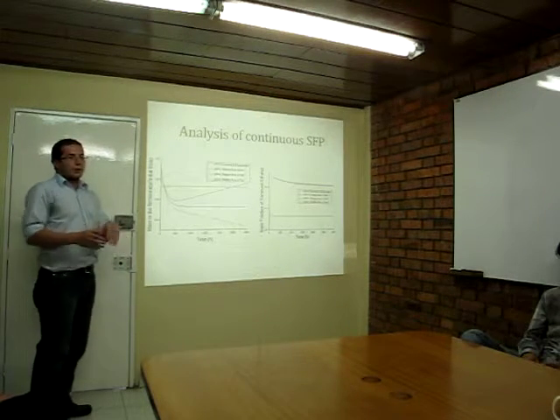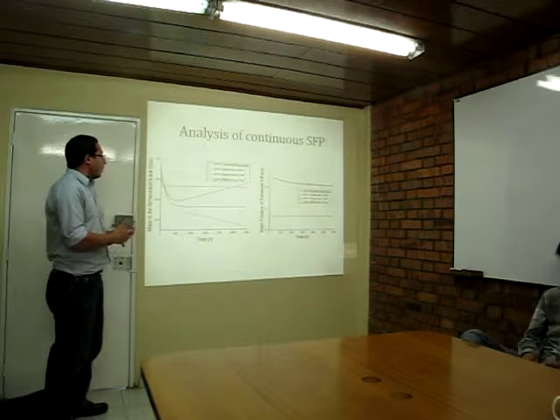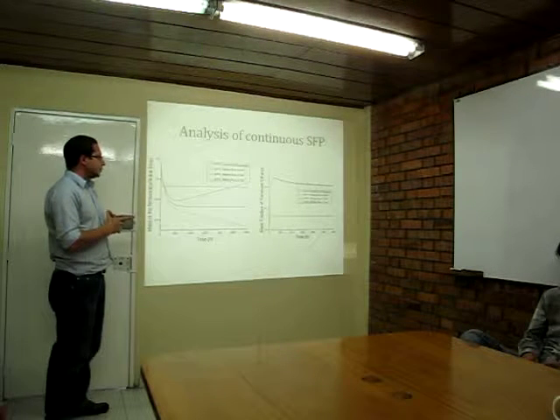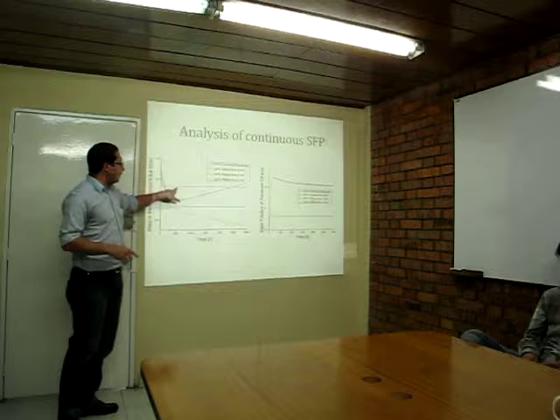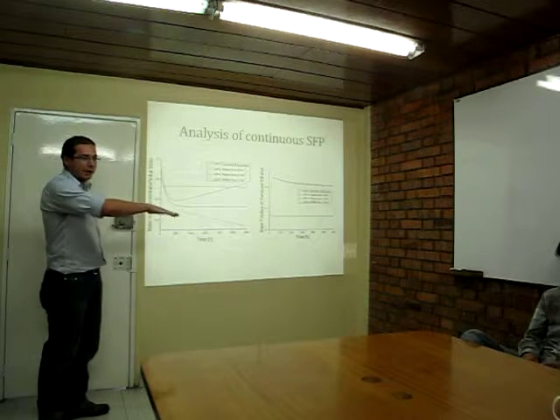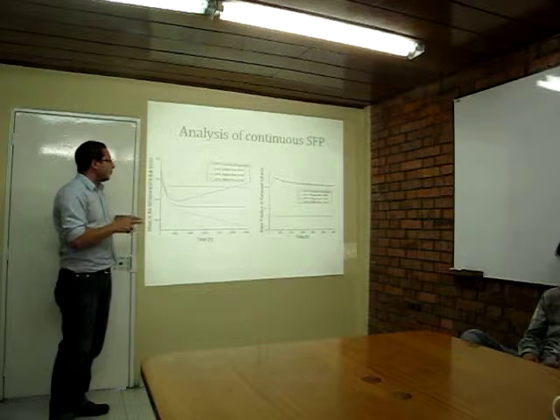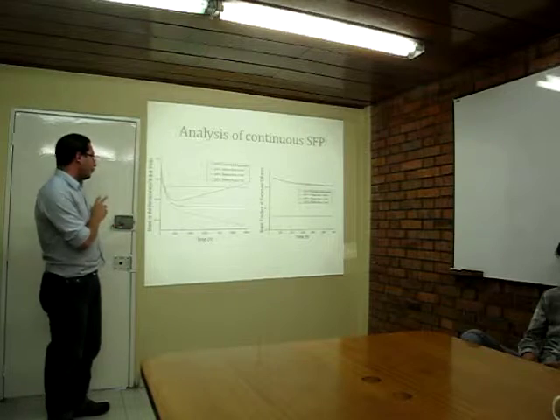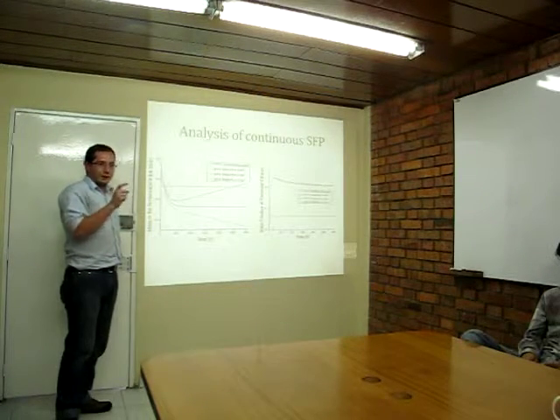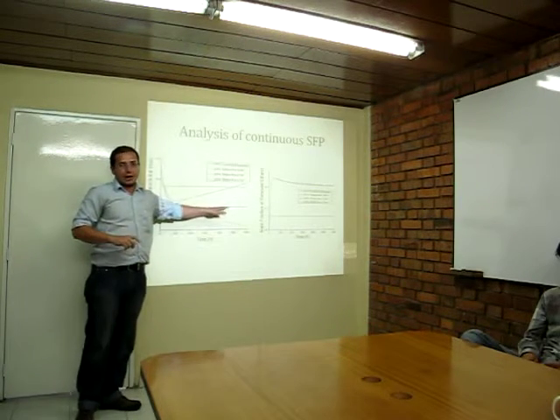We made the simulation, and we can see that a conventional fermenter has a stationary behavior, but in the integrated reactor, if we use the exact value of relative area, we have a continuous behavior.